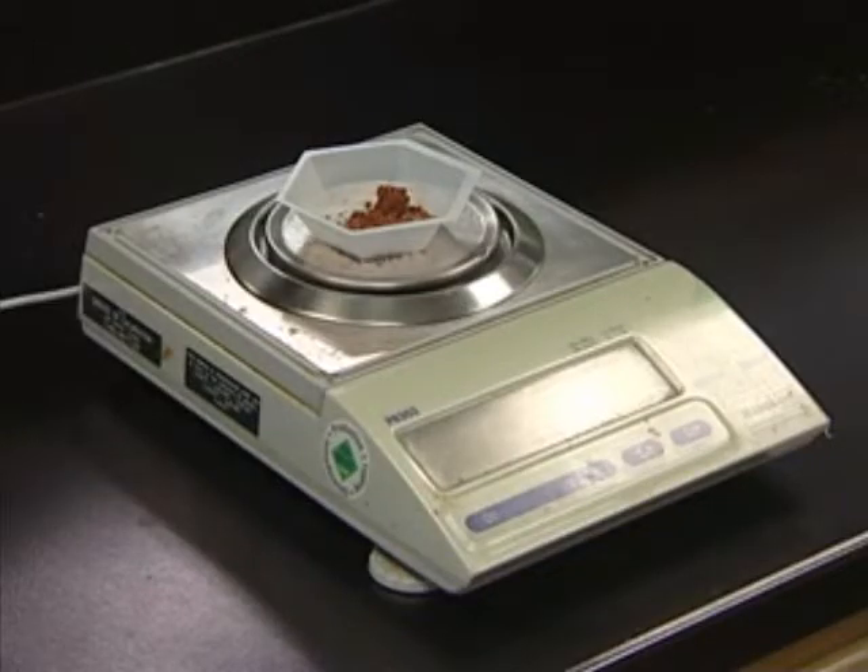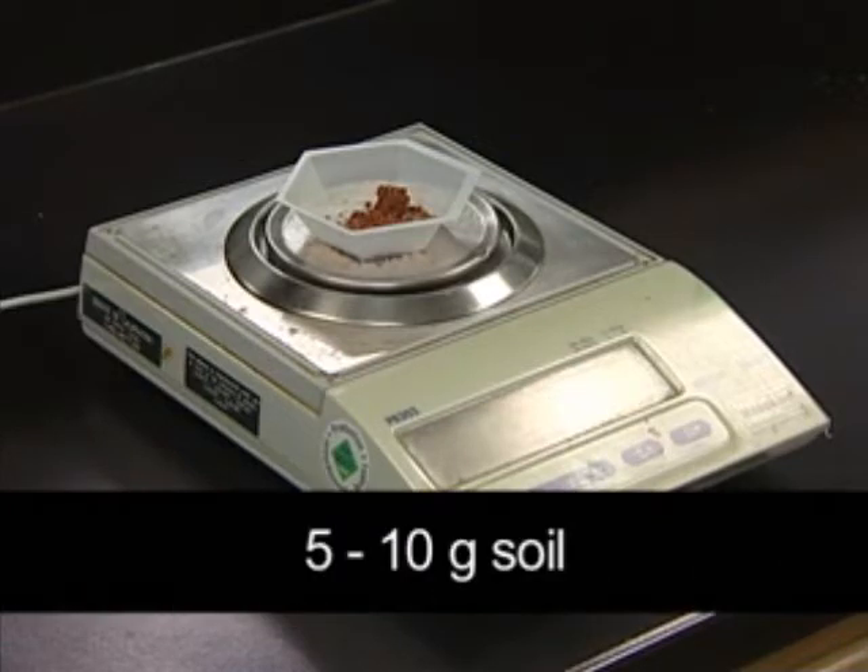To start, we need a soil sample that the DNA will be extracted from. To get sufficient DNA, the amount of soil used needs to generally be between 5 and 10 grams, although less can be used if necessary. In this case, I will use 5 grams wet weight of soil weighed out on this scale.